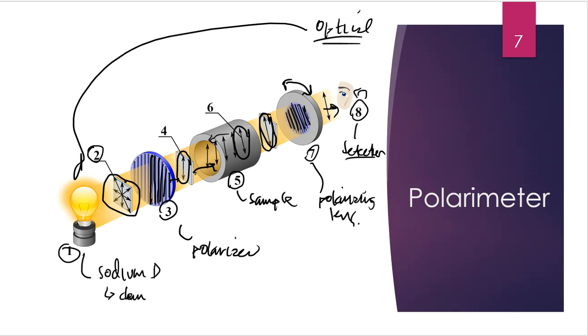So we've got to turn that polarizing lens until the orientation perfectly matches the orientation of the light after it escaped through the sample. So depending on how we turn this, that is what's going to give us our degrees. So we have a number that's here in front, and that turn is a number of degrees because think about it, I'm turning it in a circle. A circle is 360 degrees, right? So we are reporting how far we have to turn that around that circle degree-wise in order for the light to come through.